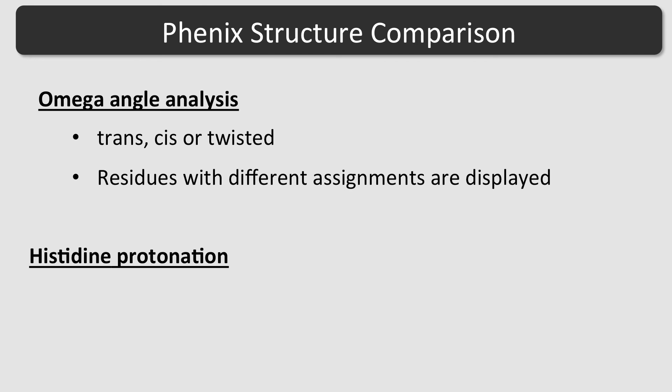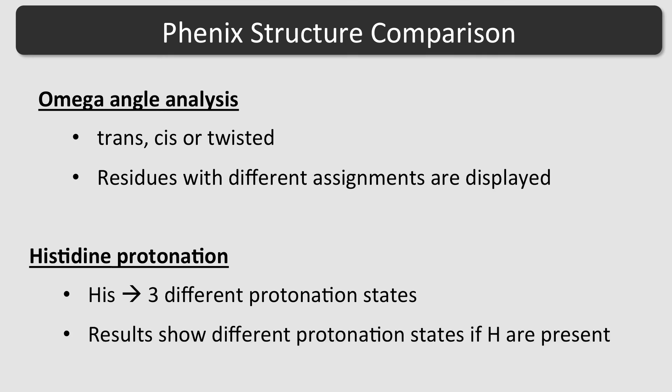Histidine protonation. The histidine side chain can have three different protonation states. The results table shows different protonation states if hydrogen atoms are present in at least one of the input models.